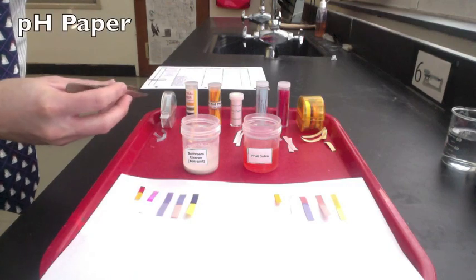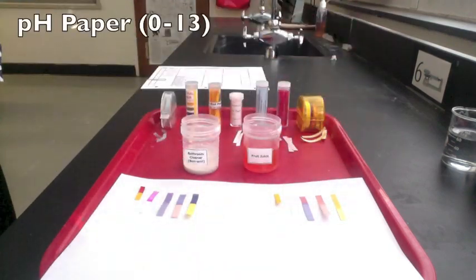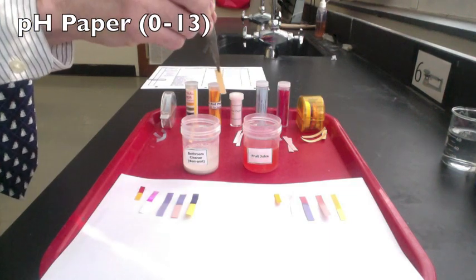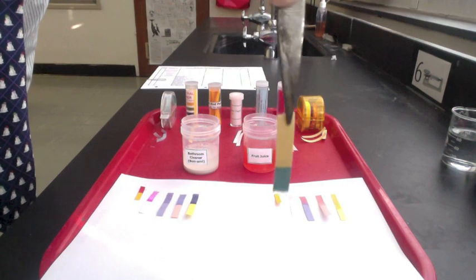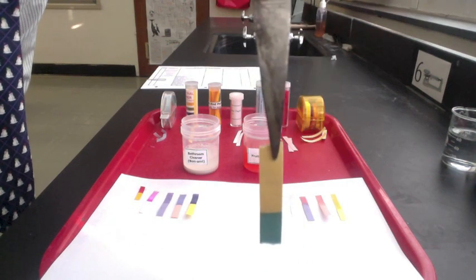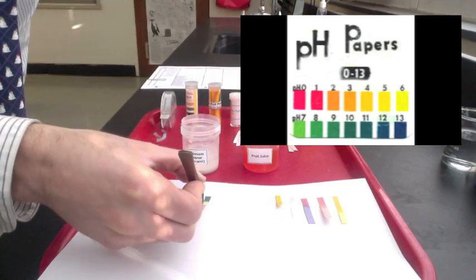We can now use pH paper, which comes in different kinds. First, we'll try for pH 0 to 13. The pH paper tells you more than just acid, neutral, or base — it tells you the pH value. You look at the color, compare it to the known chart, and get a value for the pH. When dipped in the bathroom cleaner, the pH paper turns dark blue, which indicates a pH of 12.